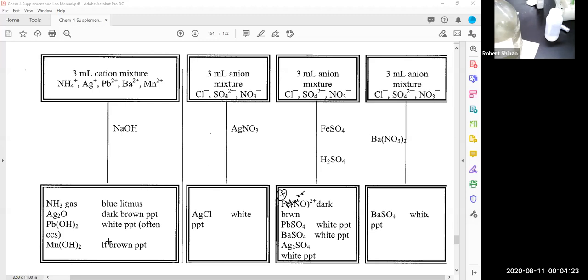All right, to prevent accidents from occurring, what we have here is an auto dispenser, or an auto pipette. In the auto pipette, we can set how much we want to dispense. Right now it's set to 0 milliliters, so I'm going to unlock it. There's a lock here. This is locked, and this is unlocked. I'm going to unlock it, and then set it to 2 milliliters.